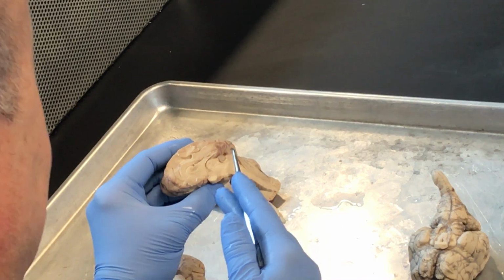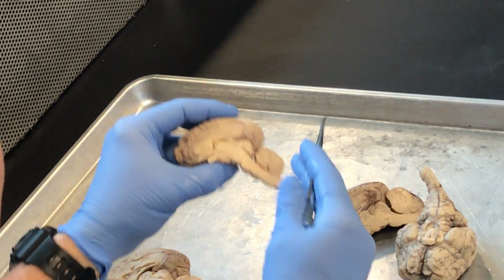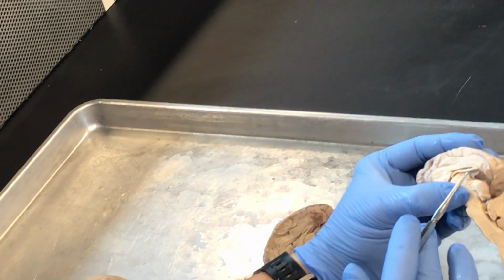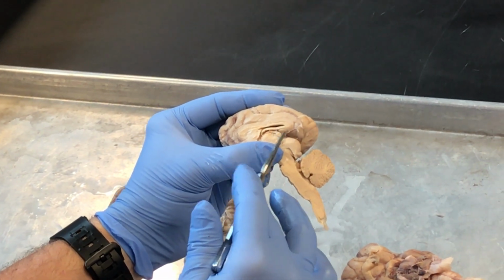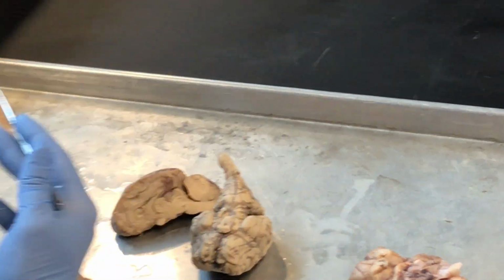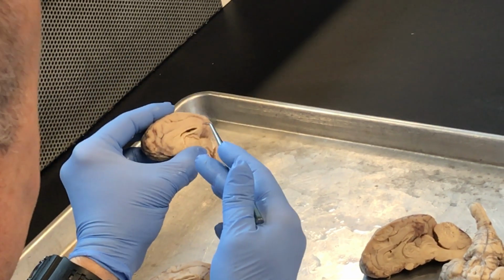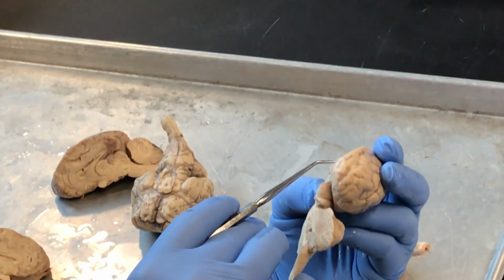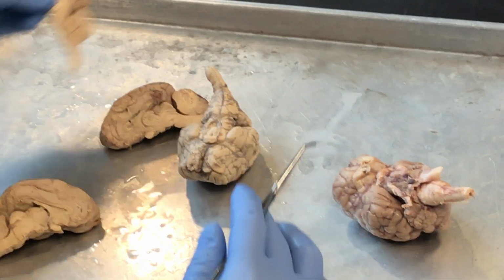So, pineal gland. Remember we talked about the lips? Let's go back to this. Upper lip, lower lip, where they come together at the back. There should be a little structure back here, P-shaped in a human, right below that posterior corner of the mouth. Right there, right below it. This is the back corner of the mouth, and right below it is where the pineal gland sits.